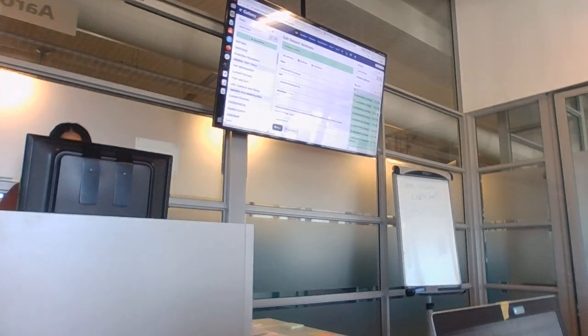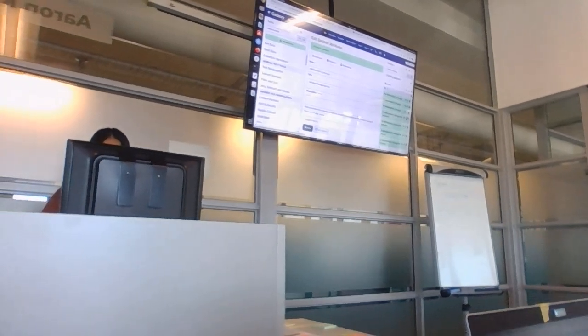Okay. What do you notice about the file names? Are there some common names, or is each file name completely different from the other?